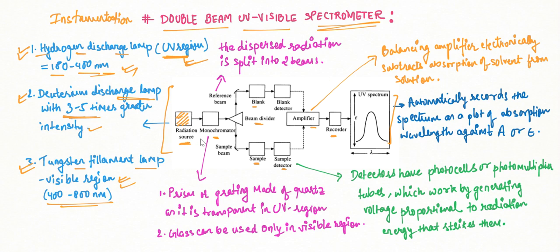Alright, then next we have our monochromator. So what is the monochromator doing?